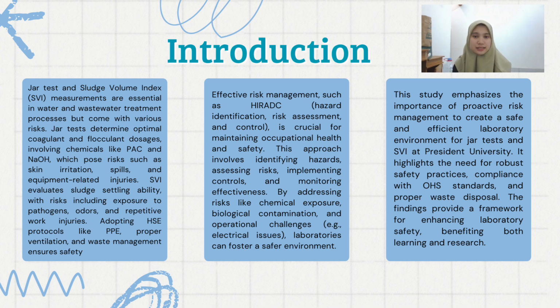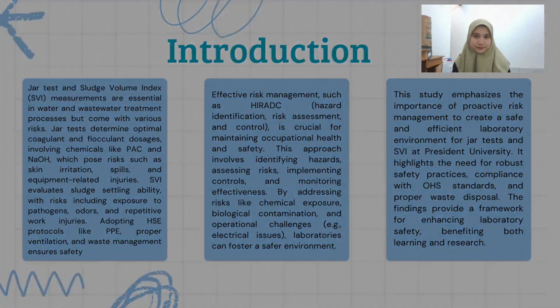This study emphasized the importance of proactive risk management to create a safe and efficient laboratory environment for jar tests and SVI at President University. It highlights the need for robust safety practices, compliance with OHS standards, and proper waste disposal. The findings provide a framework for enhancing laboratory safety, benefiting both learning and research.